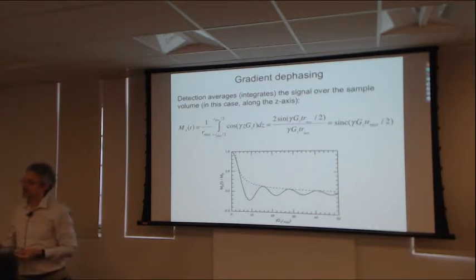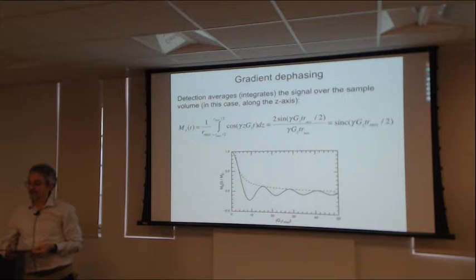One of the things that we said gradient pulses were very good at was suppressing artifacts in the spectrum or getting rid of coherence orders that we're not interested in some experiment, but they might not work very well for zero quantum coherence.